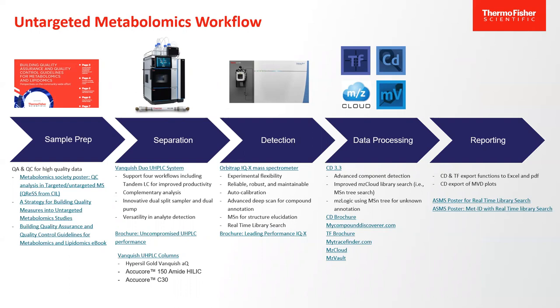Katie, is there anyone at Thermo who knows a lot about sample prep? Katie lives sample prep. Katie has a whole bunch of friends at Pierce who live sample prep for a living. Between the Pierce side of Thermo and the CCS side of Thermo, we know prep. I can't do anything in a separation if I don't have a clear sample without particulate. If I don't have those two pieces, I'm done, because I'm going to clog my LC column and I'm going to be calling Katie with another $1,000 in my pocket.